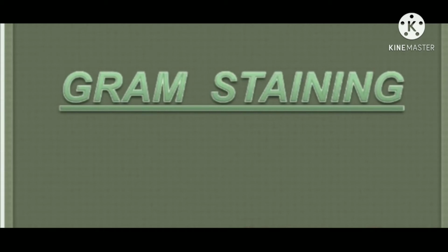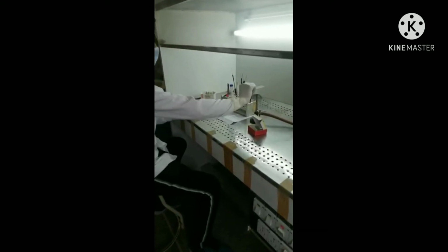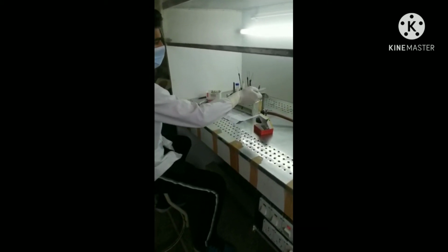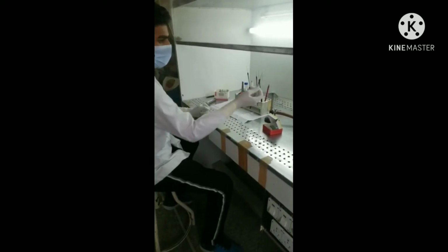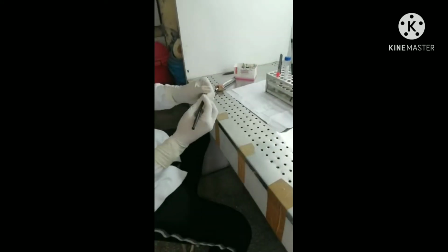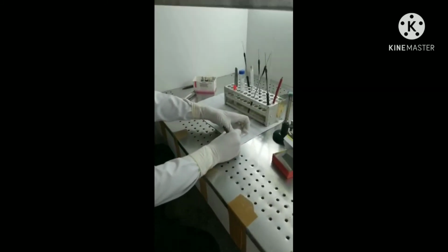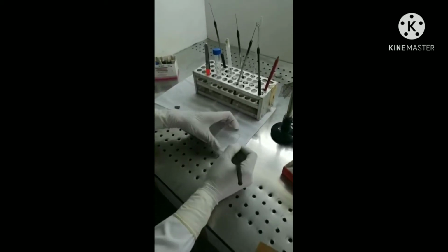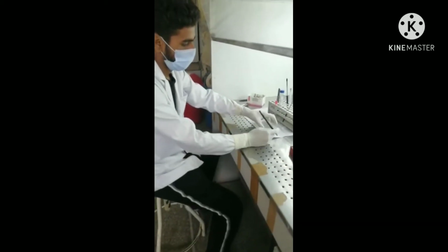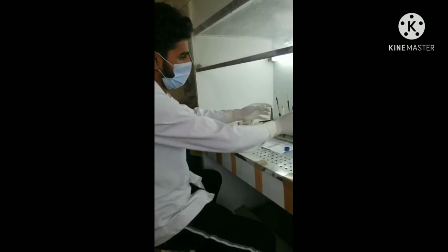Next is your Gram staining. First of all, take a clean glass slide, then make it grease free by moving left to right 10 to 12 times by flaming, and mark the slide with a glass marker. Now take a sample tube, open it and sterilize the mouth of the tube, and heat a sterile nichrome loop until it becomes red.